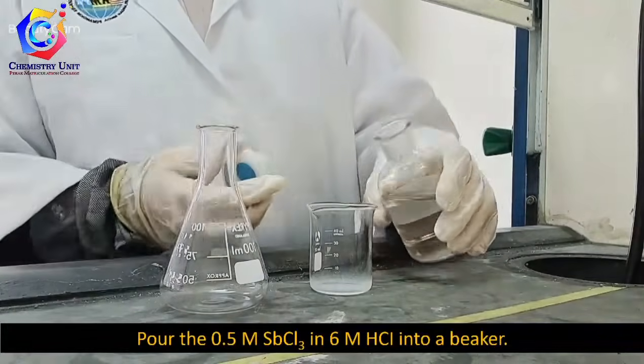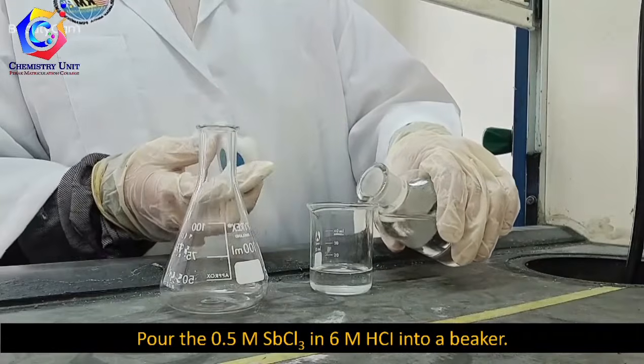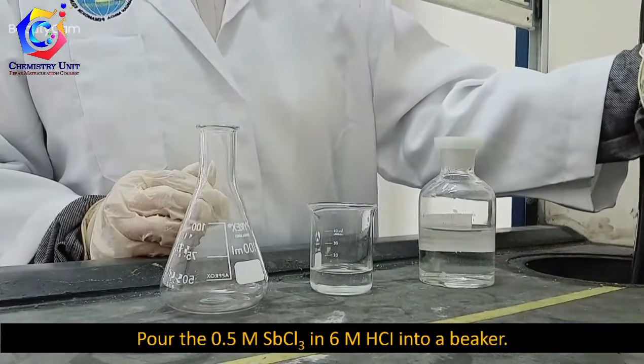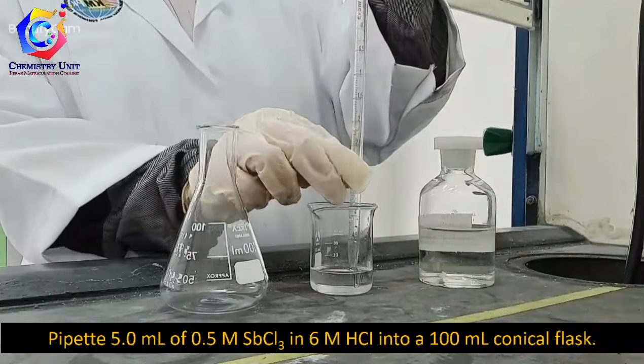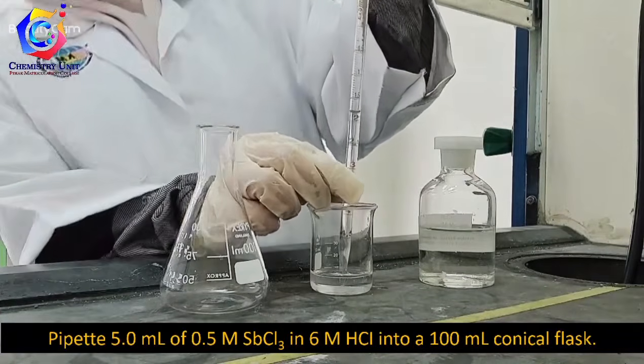Pour the 0.5 molar antimony chloride in 6 molar HCl into a beaker. Pipette 5 ml of the antimony chloride in HCl into a 100 ml conical flask.